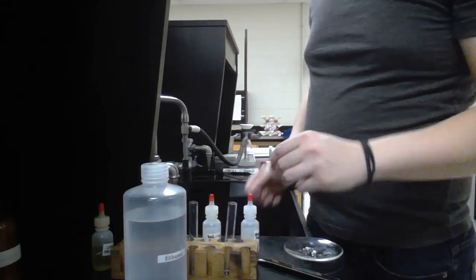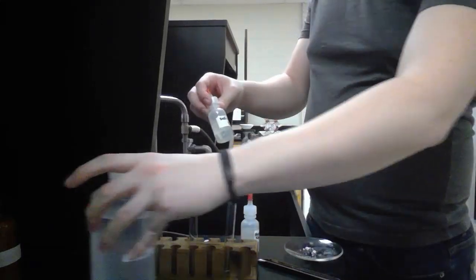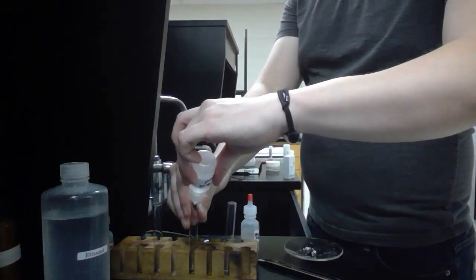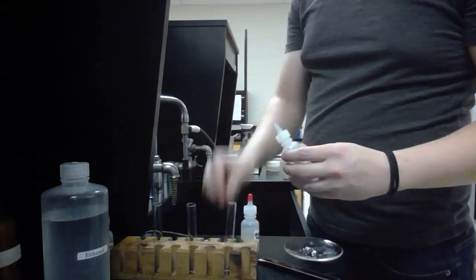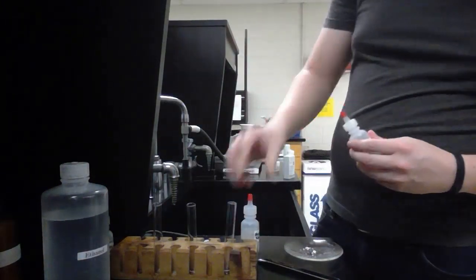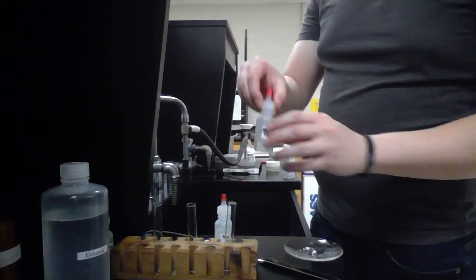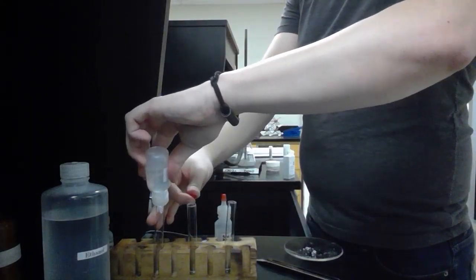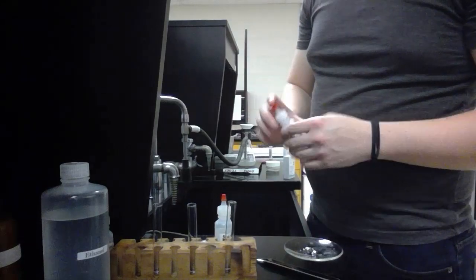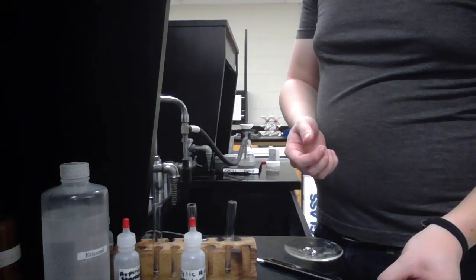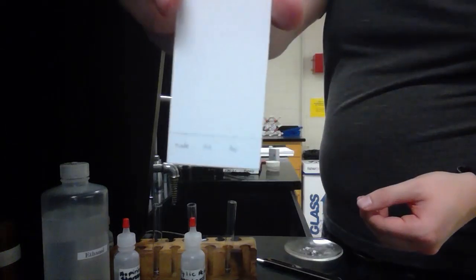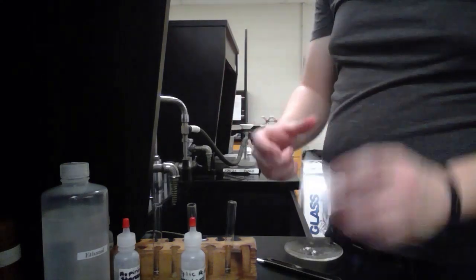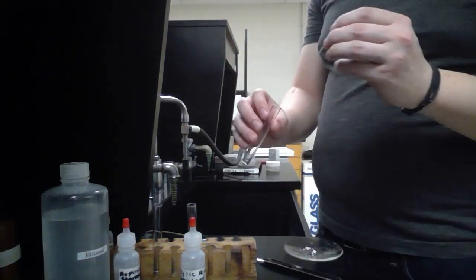Now we're going to add the standards to test tubes. This is the salicylic acid standard and this is the aspirin standard. This is our prepared TLC plate, so I have labeled there made aspirin, salicylic acid standard, and aspirin standard. We're going to spot each substance on the crosshairs.